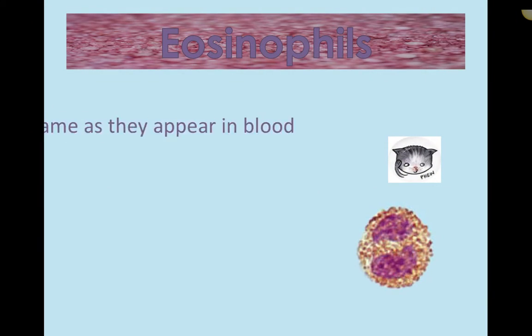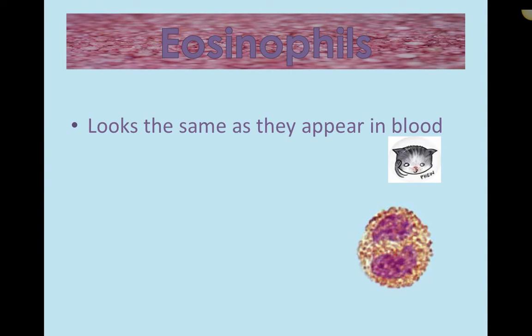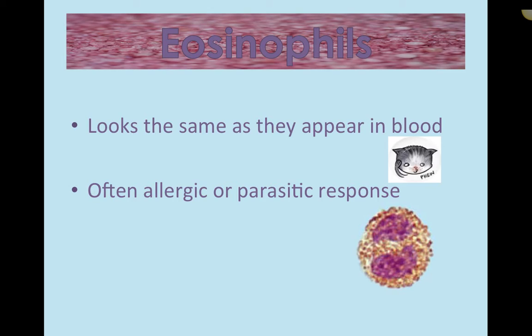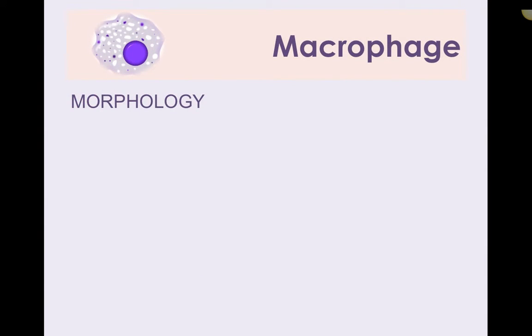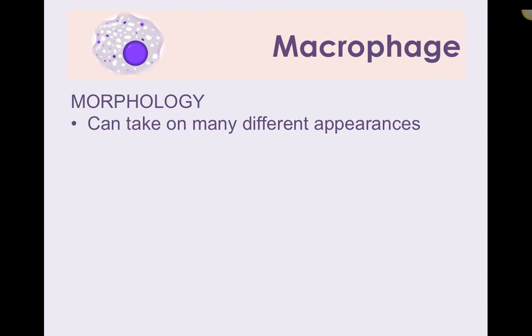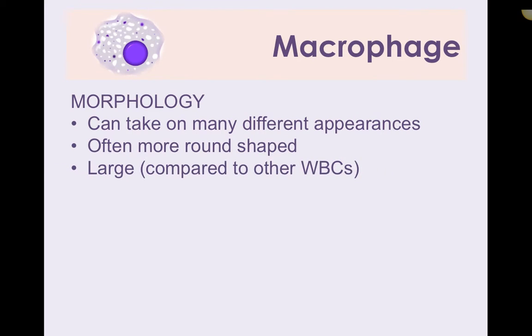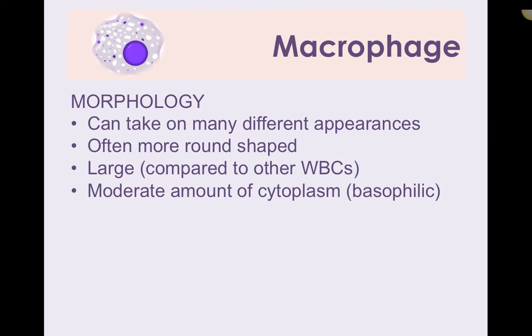To recap: Russell bodies are on mott cells, and mott cells are plasma cells with immunoglobulin globules called Russell bodies. Eosinophils look the same in inflammation as they appear in the blood — they don't undergo a lot of change. They're associated with allergic or parasitic responses. Here's a happy eosinophil — it looks the same as it does in the bloodstream.